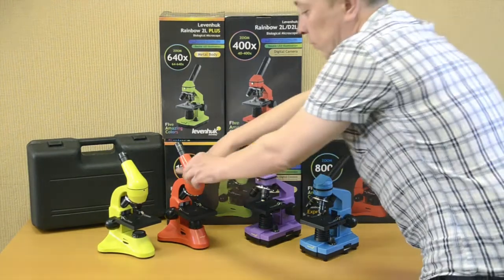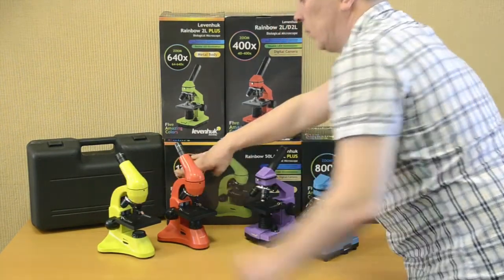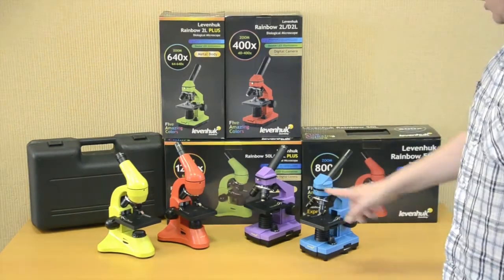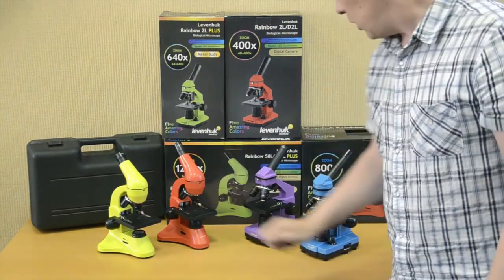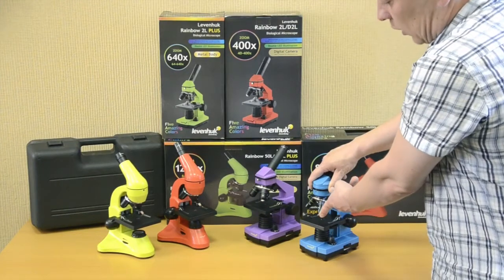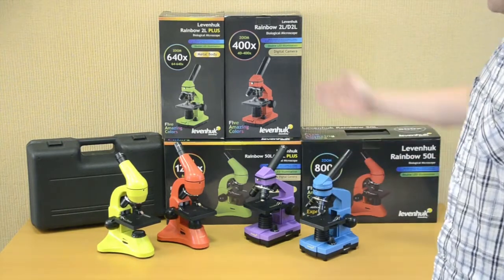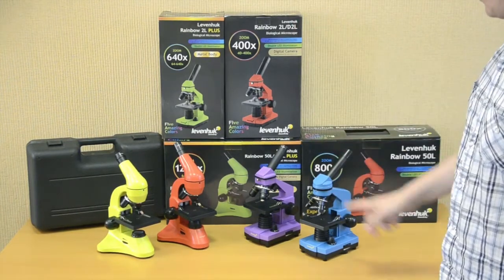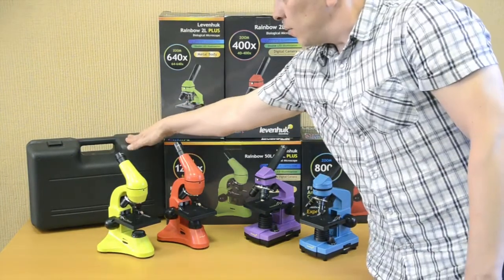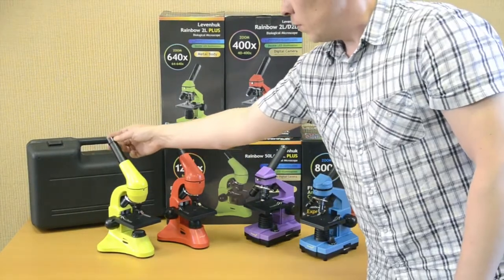Three objective lenses of 4X, 10X, and 40X magnification power are in the kit. The only difference is that the 40X objective in the Rainbow 2L models is not spring loaded. All models have color gift boxes.